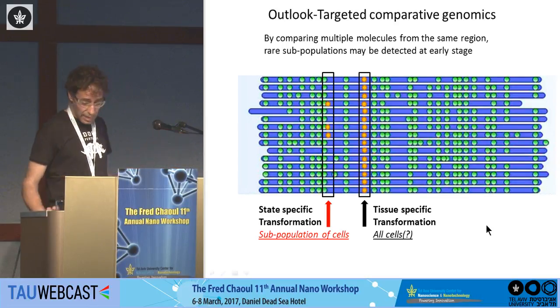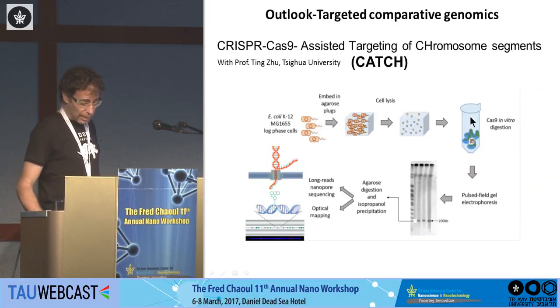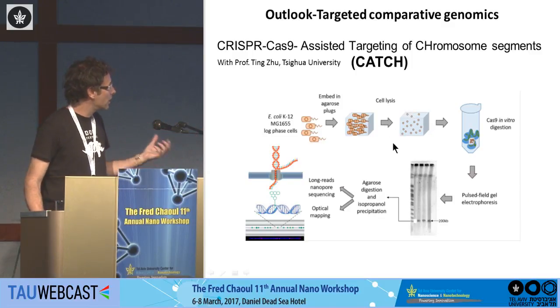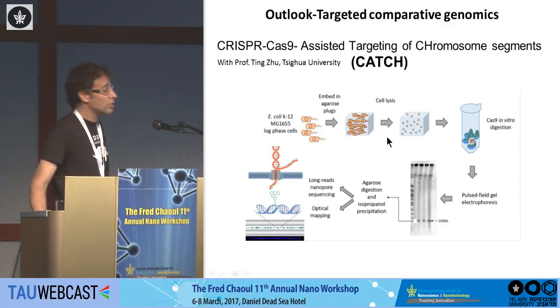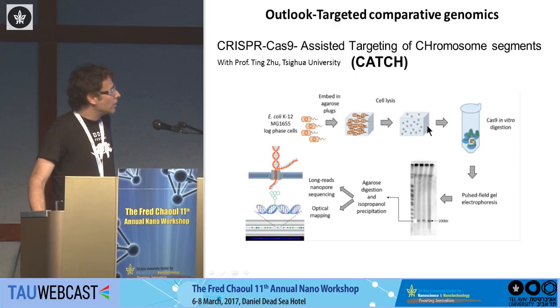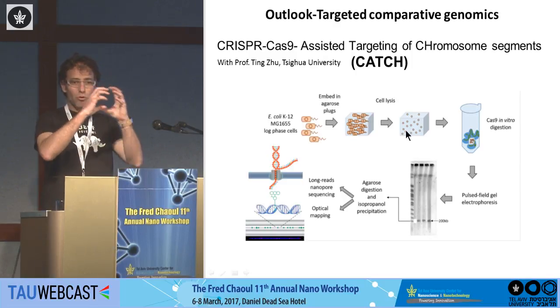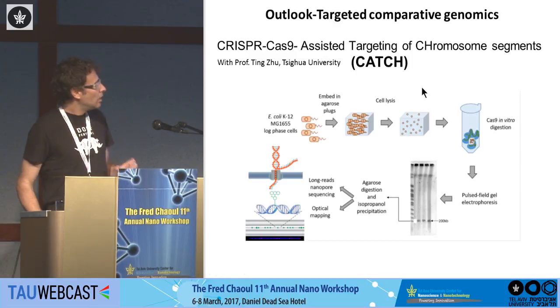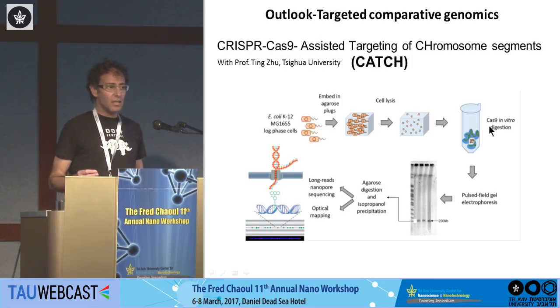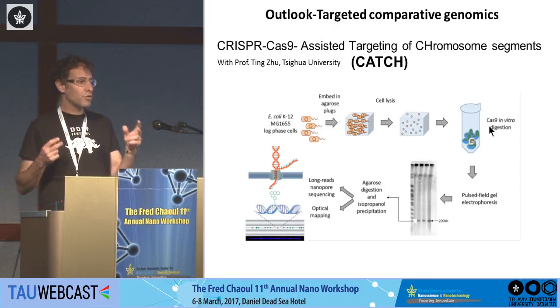And this is the idea. And just my last slide, one step closer that we got to fulfilling this, and this again, just submitted for publication. This is a work from Tzlil. What we know how to do today is to take cells, trap them in agarose, then we lyse the cells. So now we have genomes trapped in agarose gel. And now we use something very hot today. It's called Cas9. It's basically a programmable restriction enzyme.